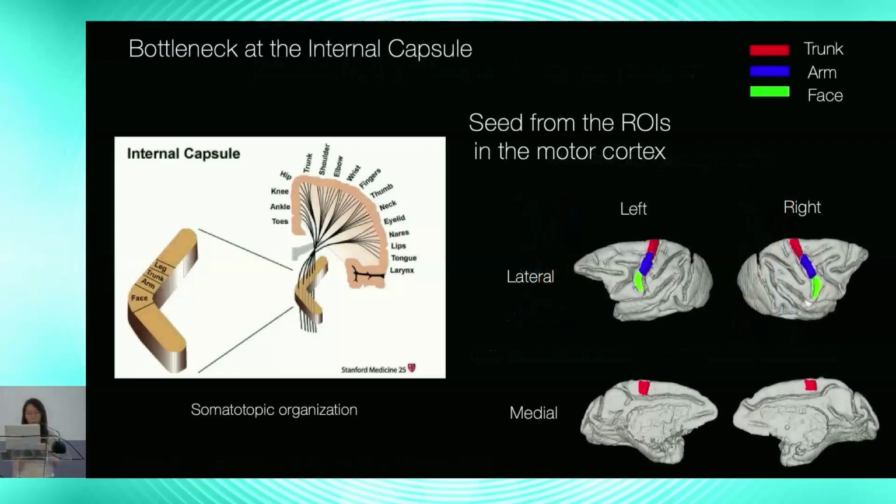So we also use our hybrid microscopy informed orientation to study it. We start the streamlines from the motor cortex, and we see whether the streamlines projecting from the motor cortex into the internal capsule will retain anatomically well-known organizations. Different motor cortex areas represent different body parts, and they will usually have a distribution from anterior to posterior in the internal capsule.